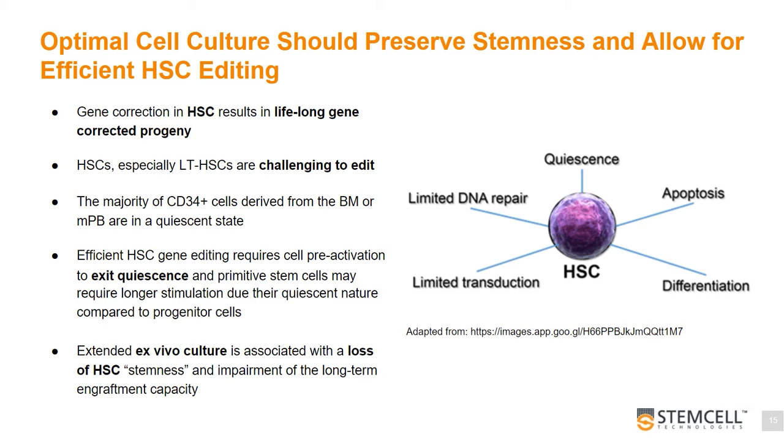Though these cells may require longer stimulation compared to progenitor cells, which will be a confounding factor in optimization of culture protocols for heterogeneous samples such as CD34 cells. Additionally, extended culture required for stimulation of primitive HSCs is associated with differentiation and impairment of long-term engraftment capacity. Therefore, optimization of culture protocols for CD34 cell editing and monitoring the frequency of primitive cells in the final sample are critical.